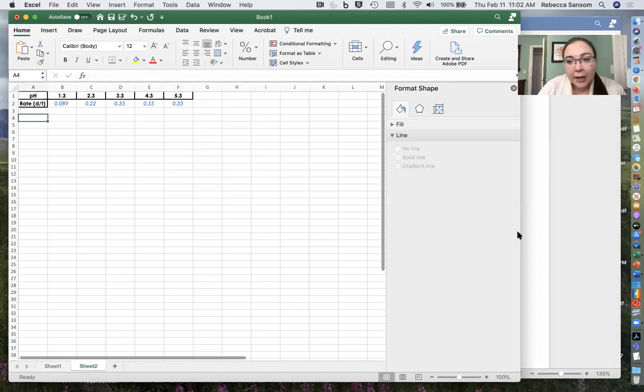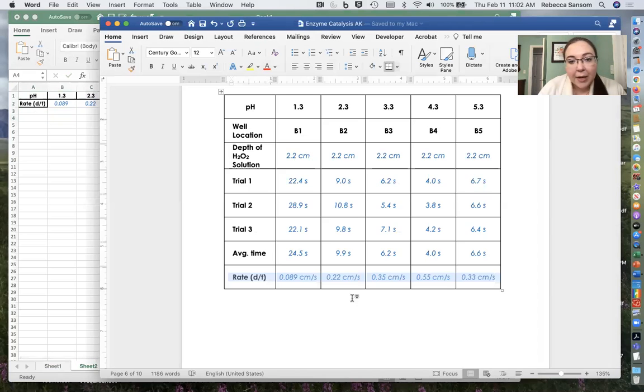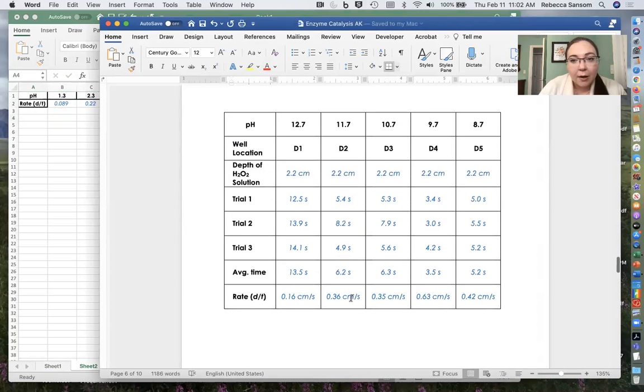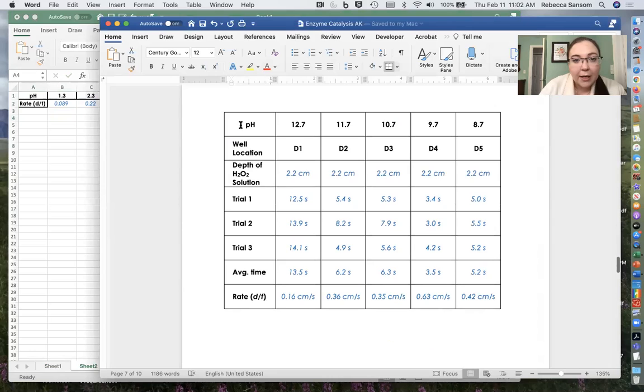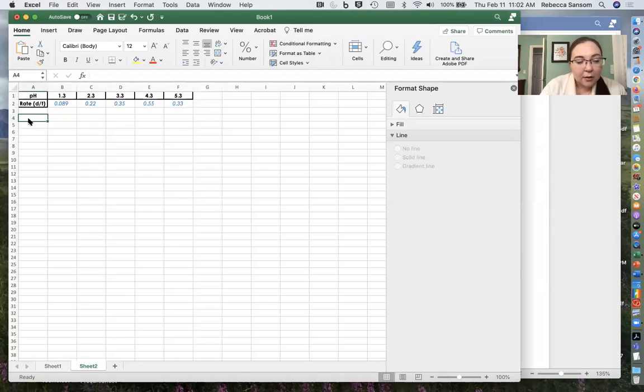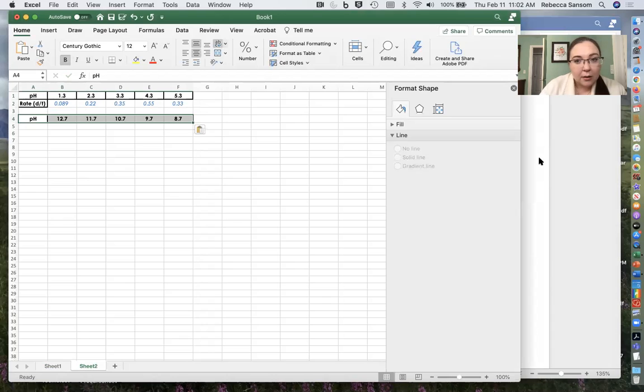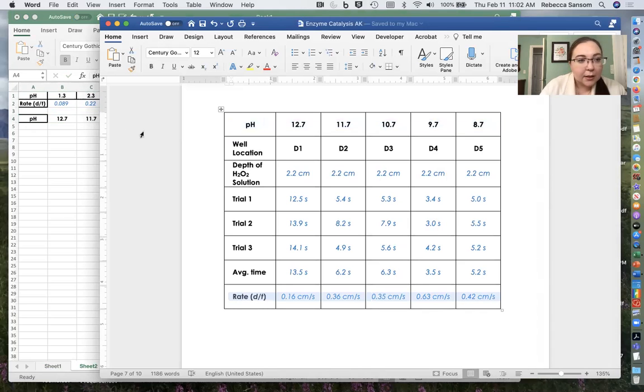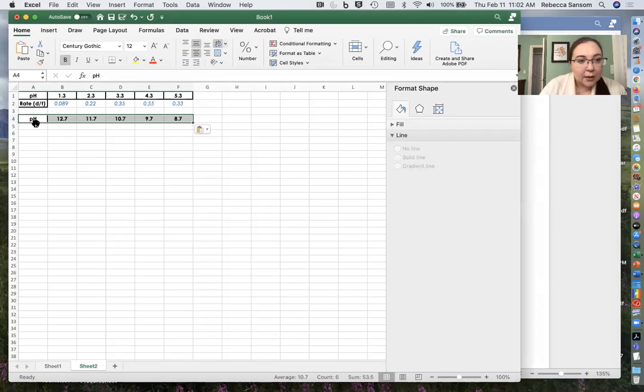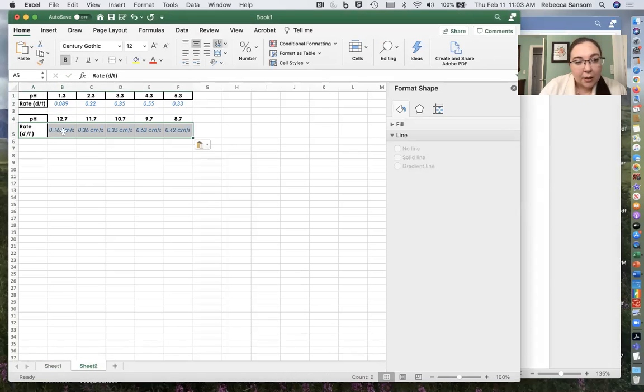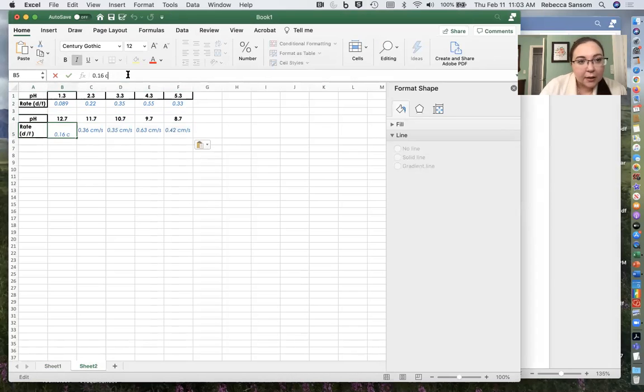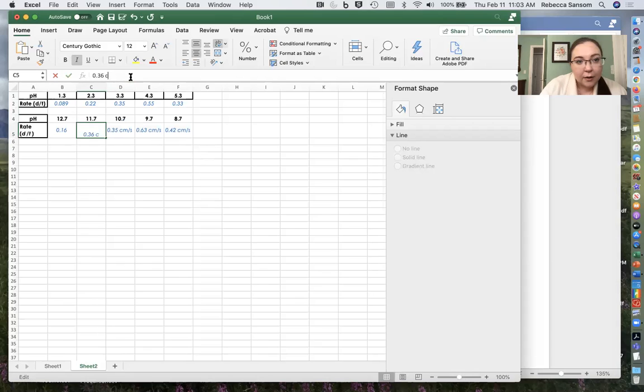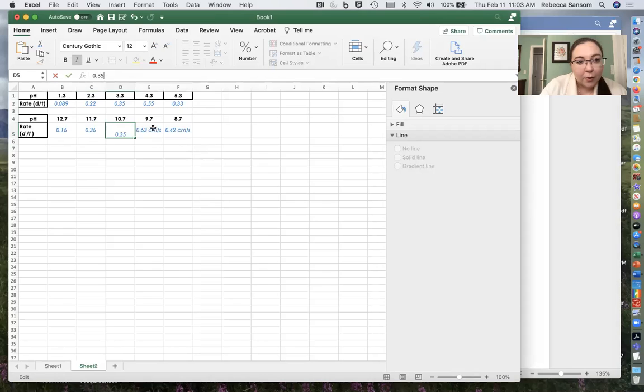I've got rate data and I need also the basic information. So I'll come over here and grab these guys and the rates and again, just fix this so that we don't have this issue with the units. Excel just likes to have numbers.